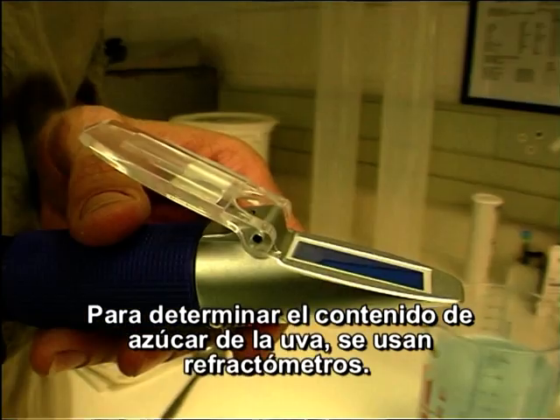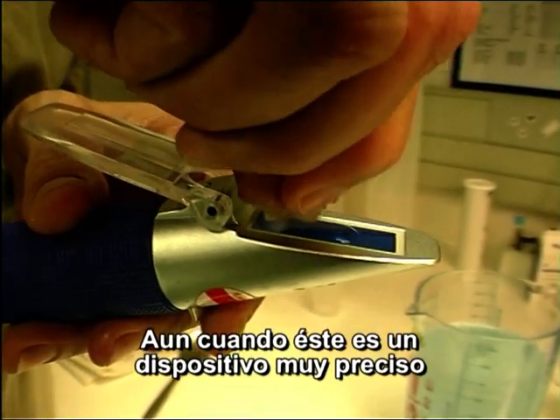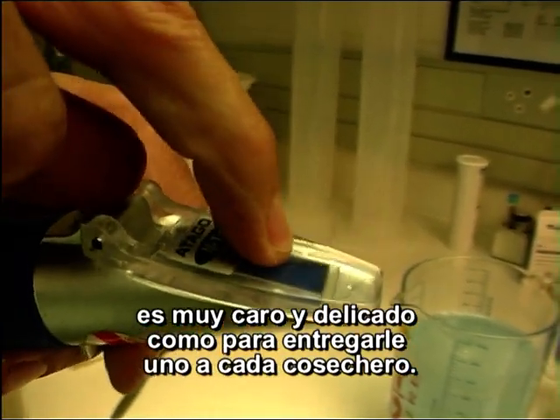To determine the sugar content of grapes, refractometers are used. Although this is a very accurate instrument, it is too expensive and delicate to issue each picker with one.